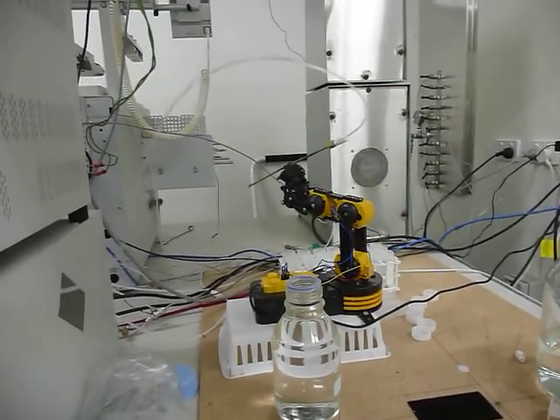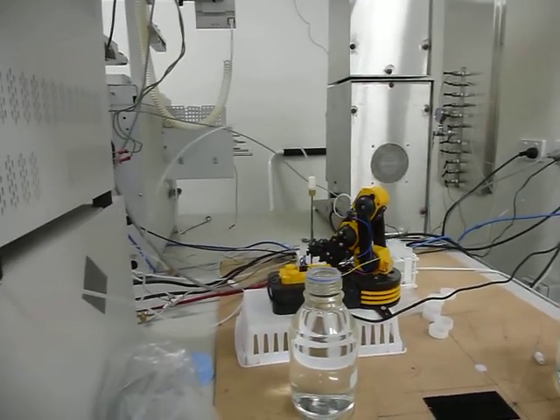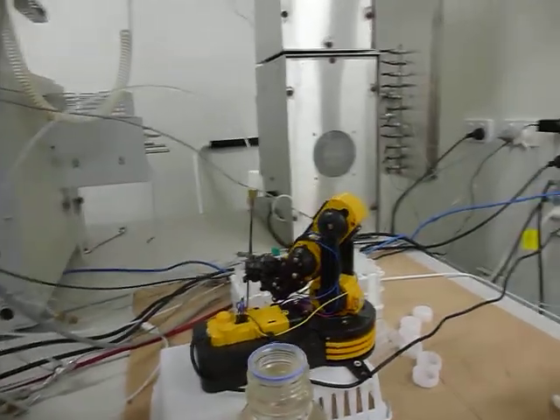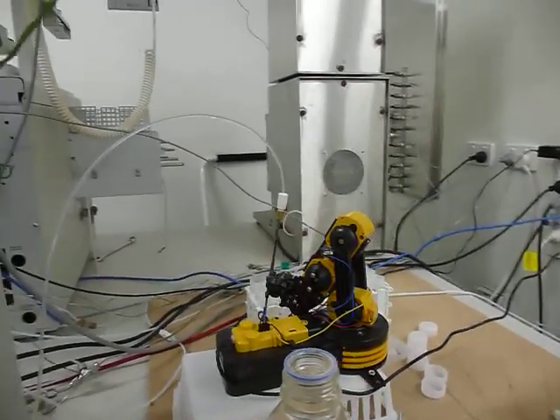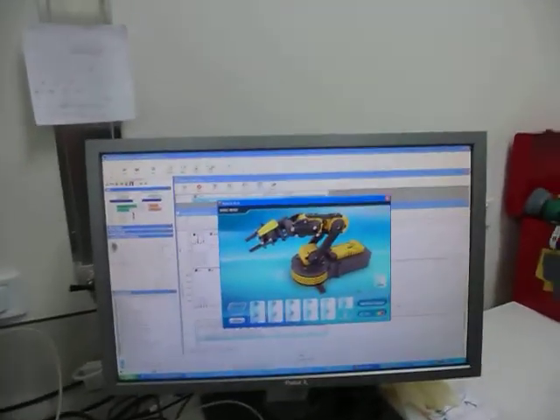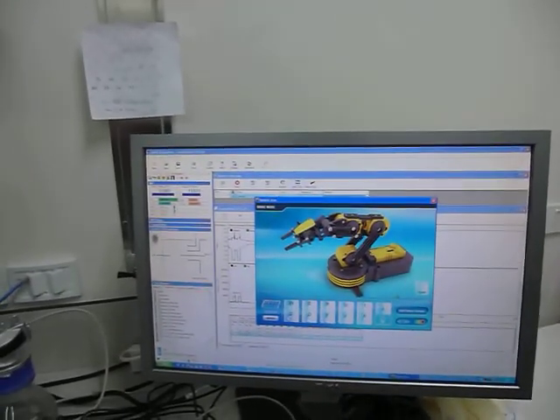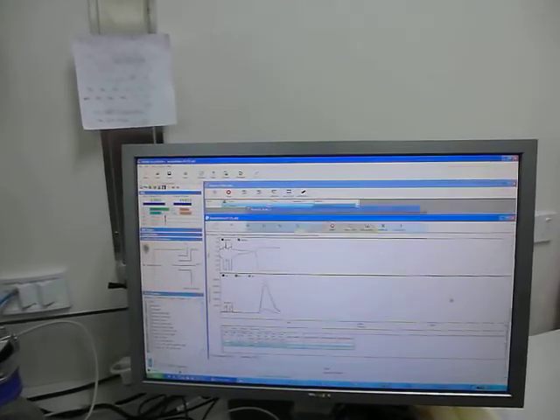It's a noisy robotic arm, but it does its job. It's doing very well. Yeah, it's noisy. So yeah, it did the second sample. You didn't see it doing the first sample, but okay, it's finished for now, the robotic arm. I can put back there the IRMS screen.